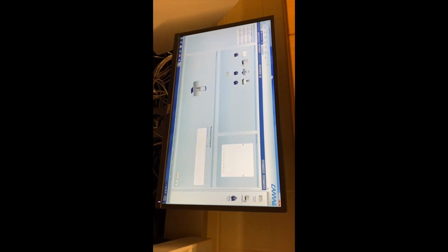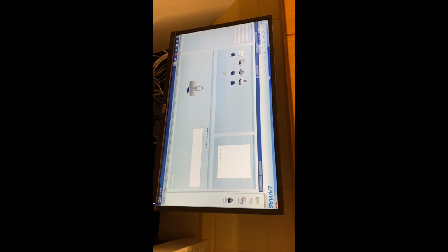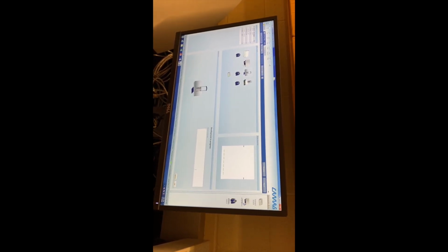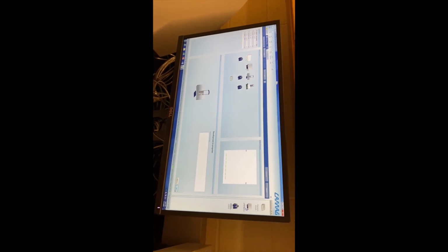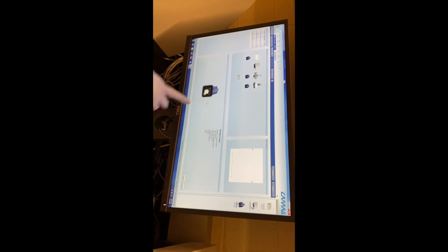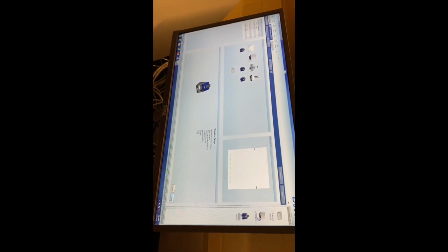So now the development process is already done. If you have any notes, you can type in here, and then it will be in the final report. So now we're clicking OK, and then the next step is the visualizer, and we already put the plate in, so we can just click continue, and then it will take pictures.